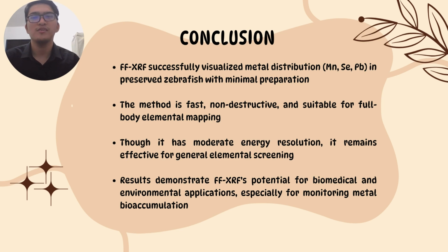For the conclusion, full-field X-ray fluorescence spectroscopy successfully visualized metal distribution such as manganese, selenium, and lead in preserved zebrafish with minimal preparation. Next, the method is fast, non-destructive, and suitable for full-body elemental mapping. Though it has moderate energy resolution, it remains effective for general elemental screening. And lastly, the result has demonstrated full-field X-ray fluorescence spectroscopy's potential for biomedical and environmental applications, especially for monitoring metal bioaccumulation.